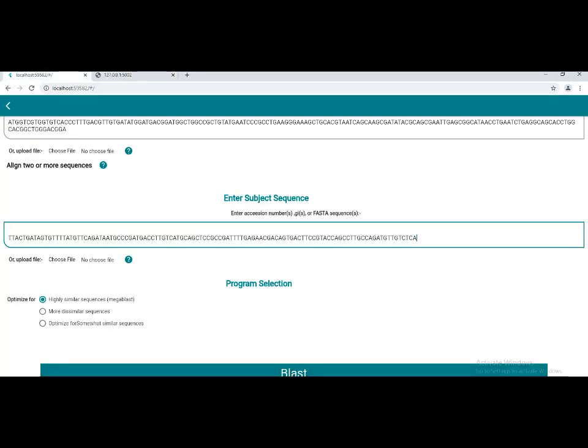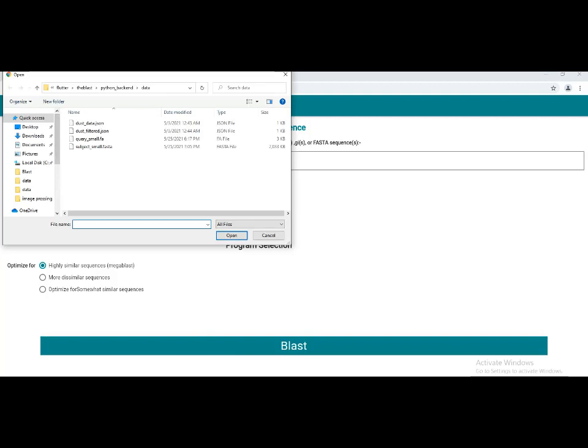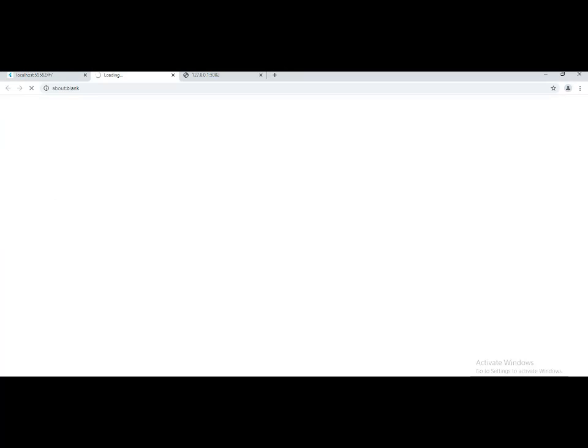وفي أوبشنز تانية لو أنا عايزة أختار فايل. هنا لو أنا عايزة أعمل السيرش ما بين فايل، أنا هختار من عندي مثلا dot fasta مع الداتابيس بتاعتي أو مع فايل تاني. خلاص أنا هختار الفايل اللي أنا محتاجاه. مثلا أنا عايزة أعمل كويري، تمام، على الفايل ده أعمل open، وبرضه بحدد نسبة السيميلاريتي وبضغط على BLAST عشان تجيب لي نسبة السيميلاريتي.